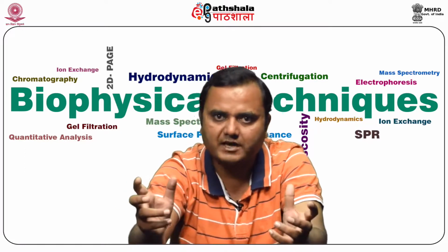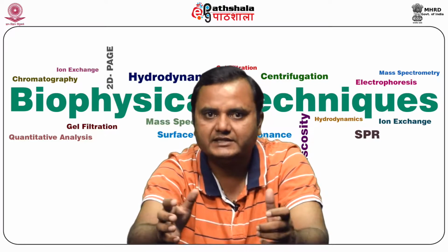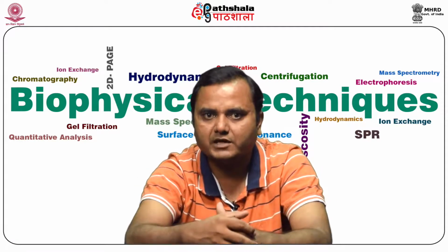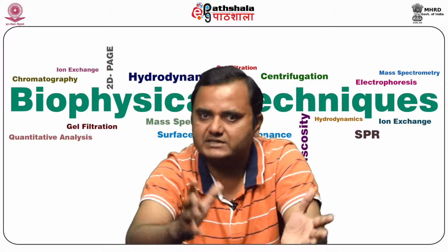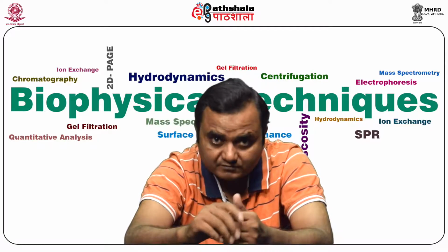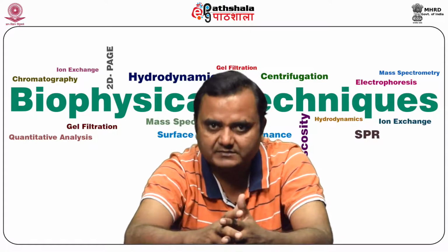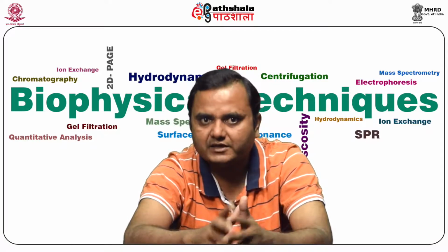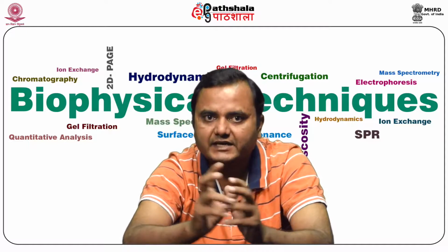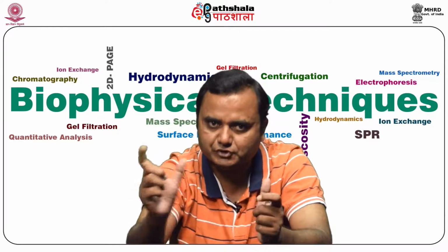Since most macromolecules have greater densities than the medium, separation is based on the S value, so it can be used to separate molecules with relatively close S values in the sucrose density gradient. Another gradient medium is the cesium chloride density gradient medium, which is used for isopycnic or buoyant density centrifugation. A linear gradient of this compound in a buffer is prepared in the centrifuge tube.